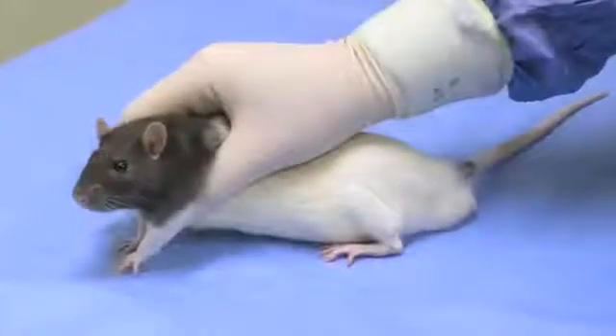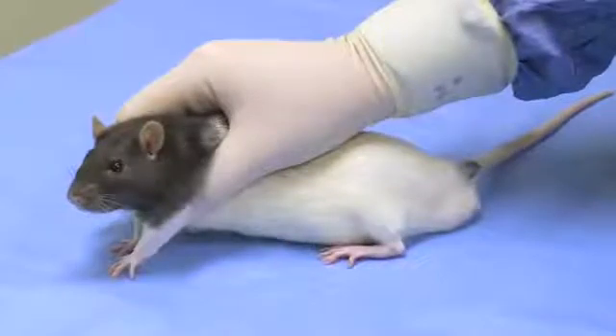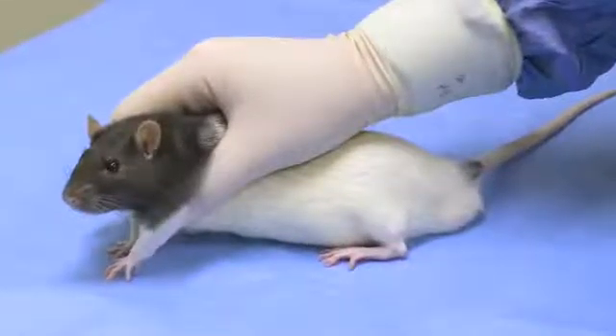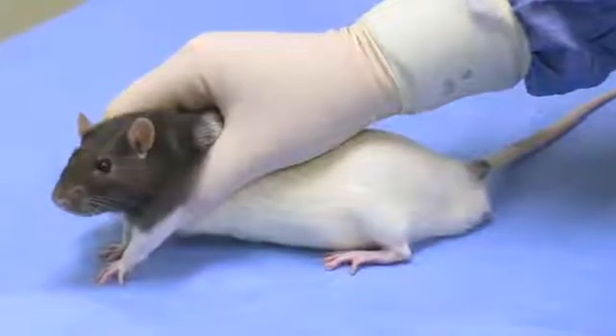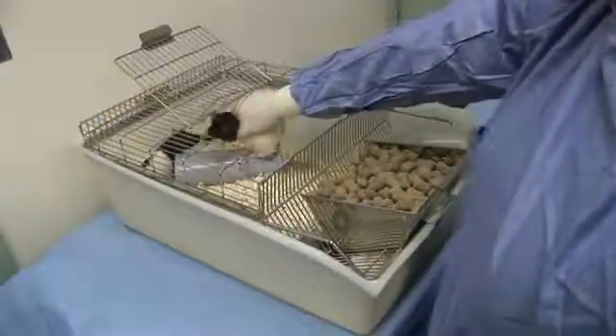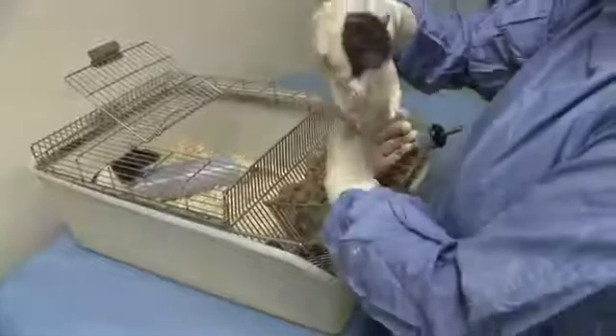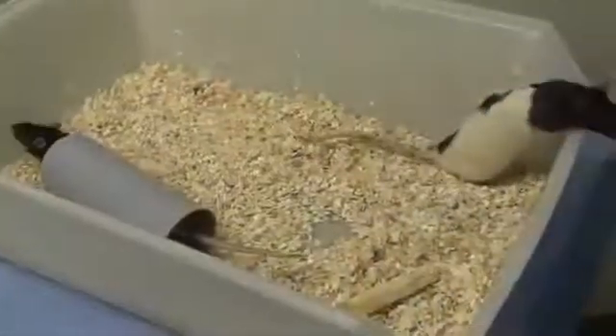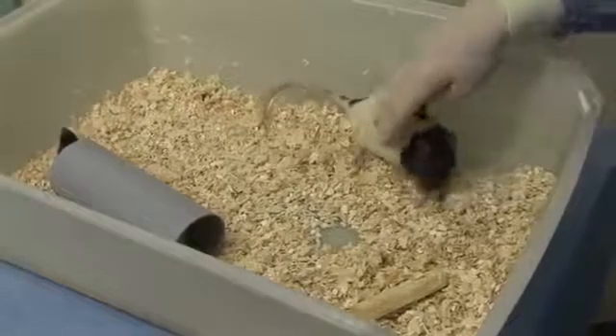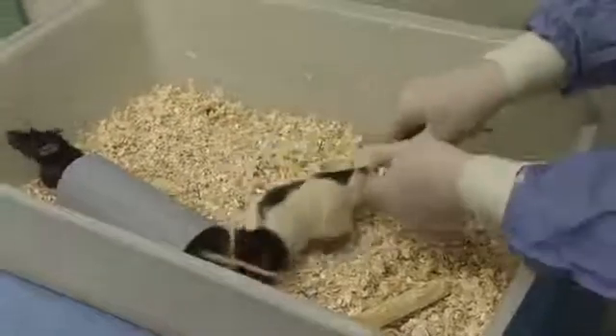The first rat to be injected should then be restrained smoothly without hesitation by grasping the animal around its shoulders. The rat should then be lifted from the floor of its cage onto your arm or onto the cage lid. If the animal is very active, it can be restrained by holding the base of its tail before picking it up around its shoulders.